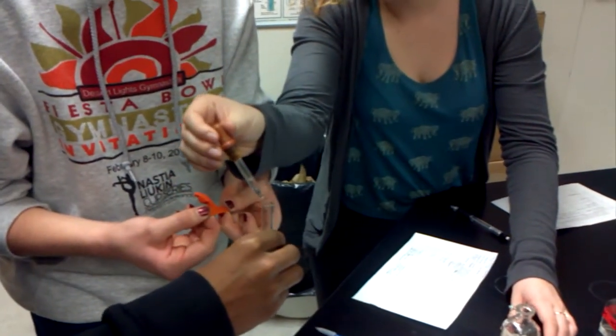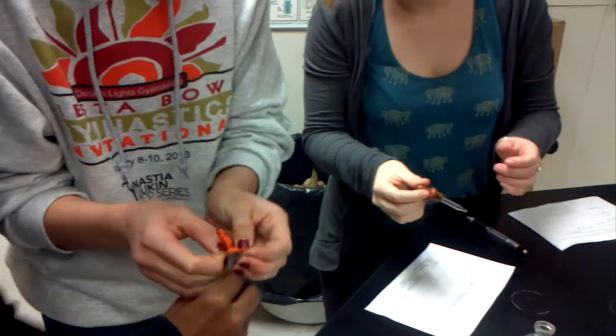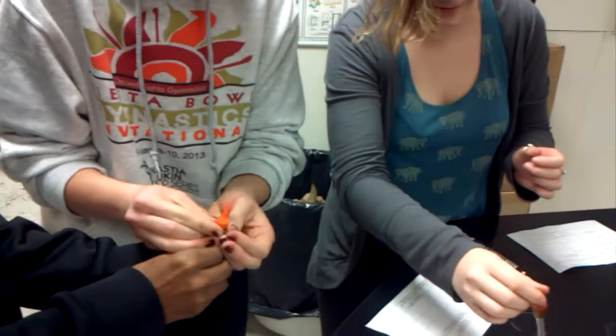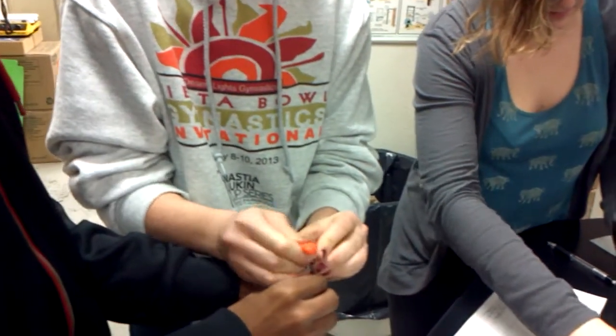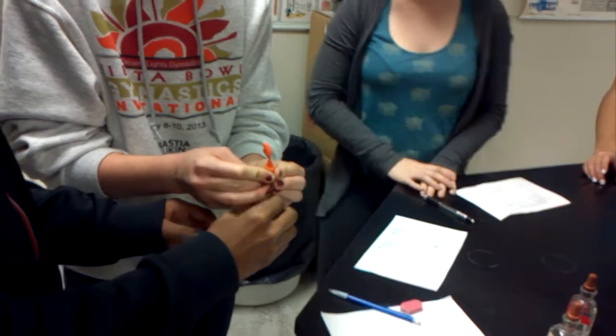Okay, ready? Just put all of it on there quick. There you go. Kind of, yeah, there you go, just give it a few seconds and you can look at the contents at the bottom.